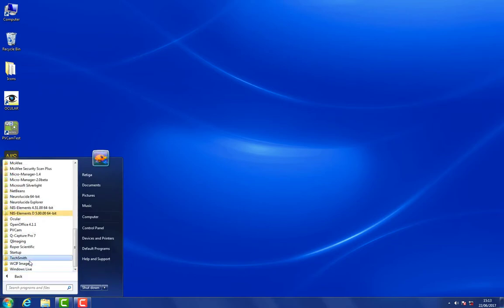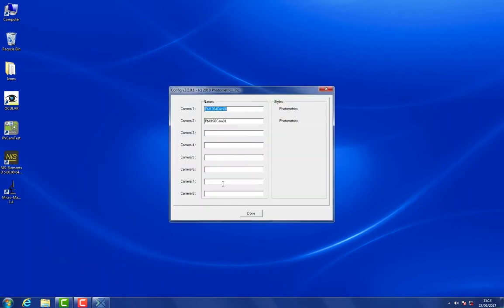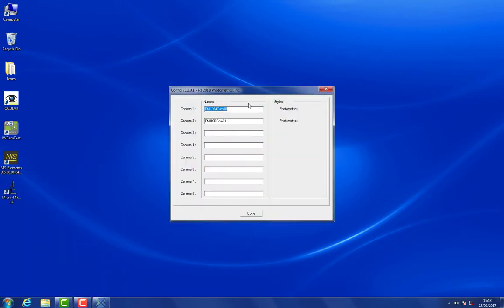We include in our driver set some very useful little utilities for this. The first one is called RSConfig and you can find it in the PVCam group in Start Menu. Here we show how many cameras you have plugged in.